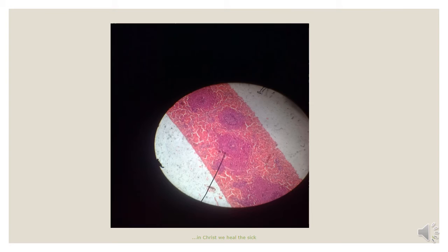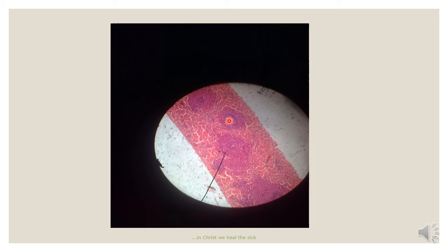This is another slide of the spleen. Here we can note the pink background, which is the red pulp. And then the white pulp — the cell aggregates you can see here — which represents the white pulp of the spleen.